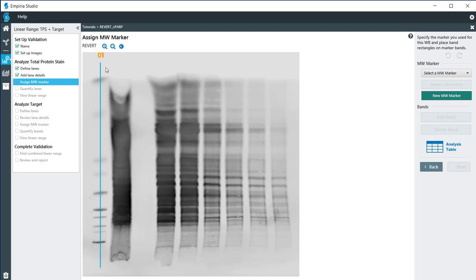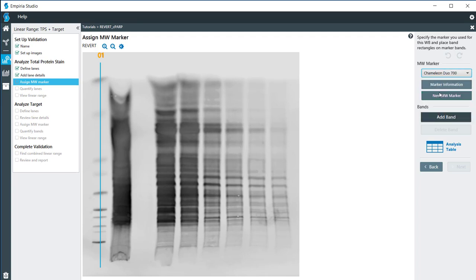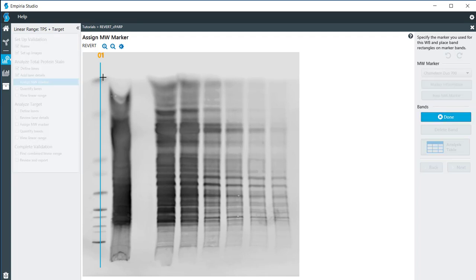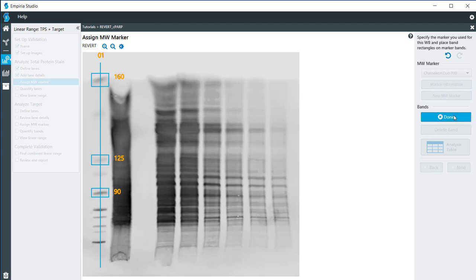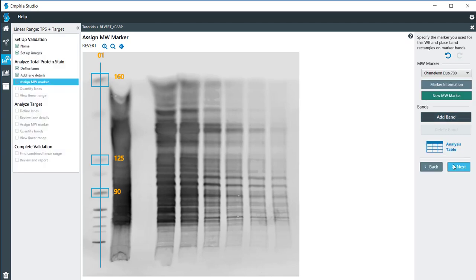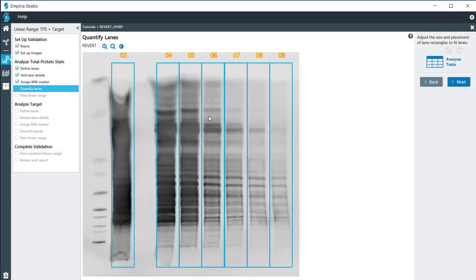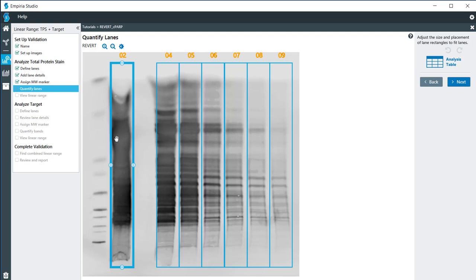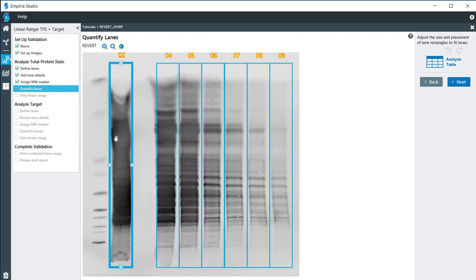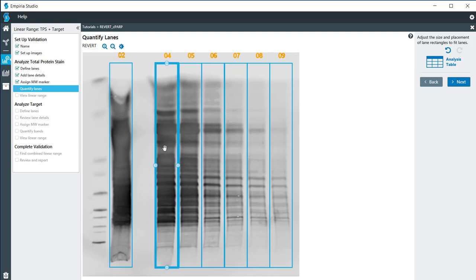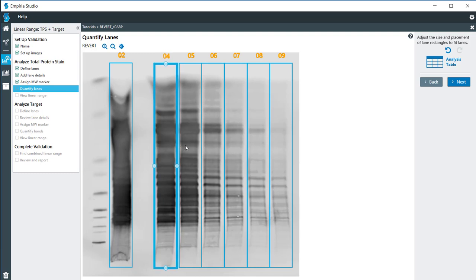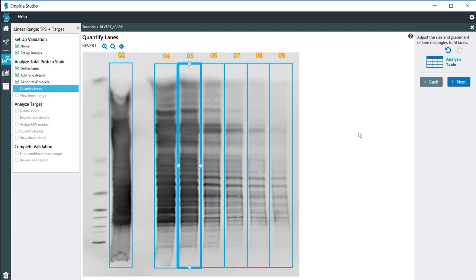The molecular weights for the revert images are not that important, but we do have to assign molecular weights for us to move forward. I'm just going to add a few bands on here. I'll explain the molecular weight determination in more detail on the next image. If I need to adjust the location of the lanes I can do that so that I'm including all of the revert signal. I'm going to click on next.